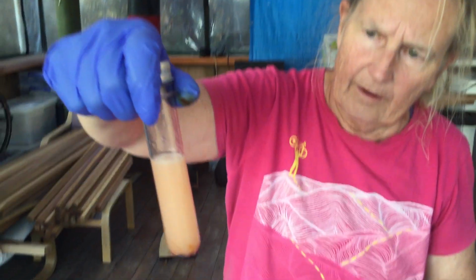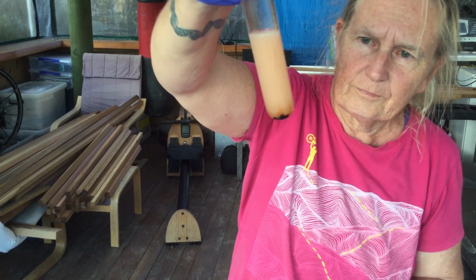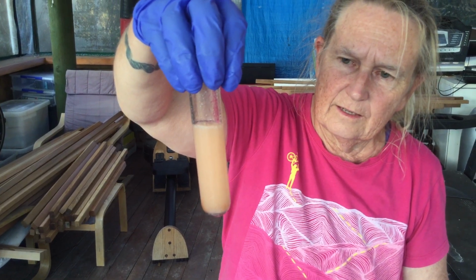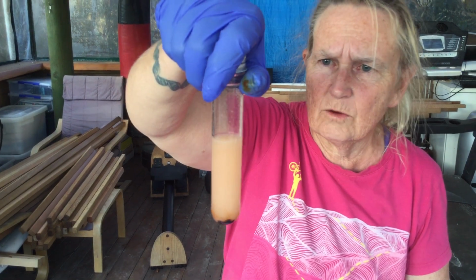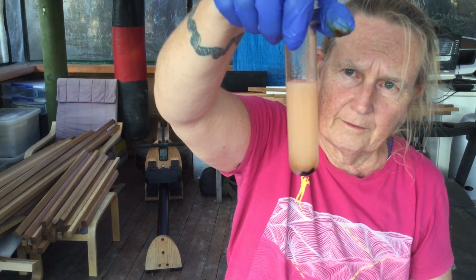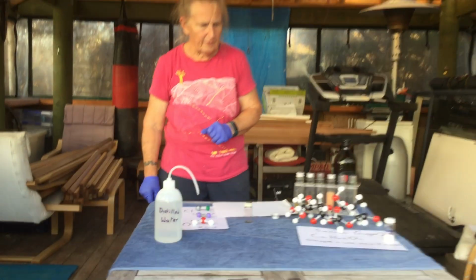So I think we might have to come back and see this settled out, and you'll be able to see that all of the colour is in the oil and not in the water. It'll take a while to settle out, so I might have to add a photograph in about 10 minutes time. Okay, I hope that sorted that experiment for you.